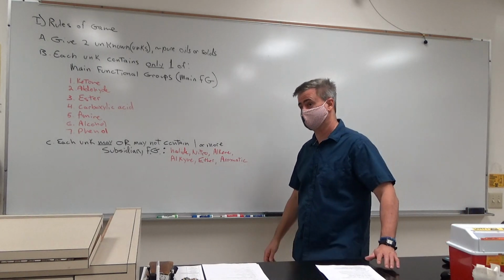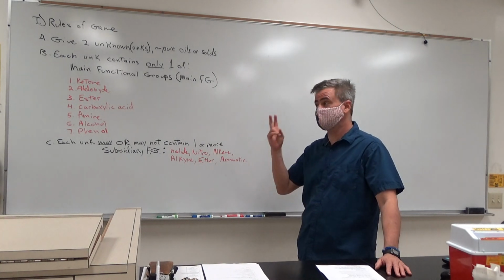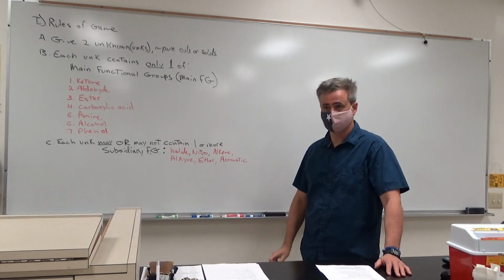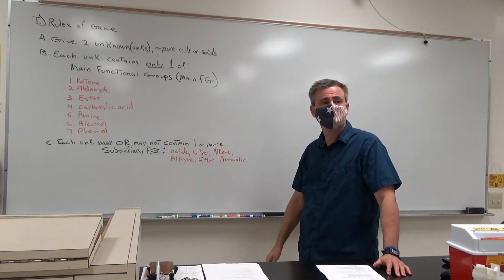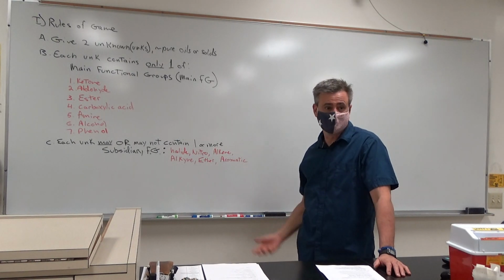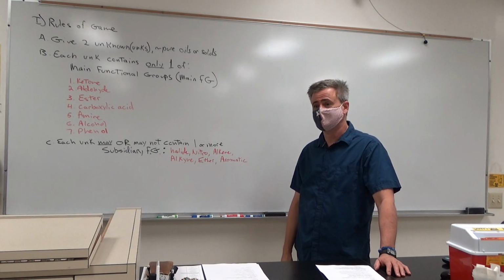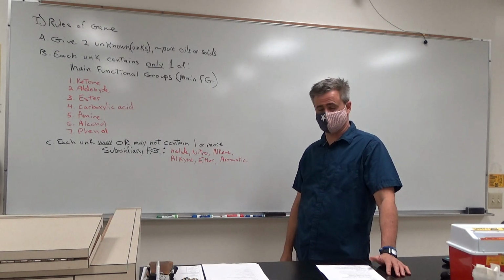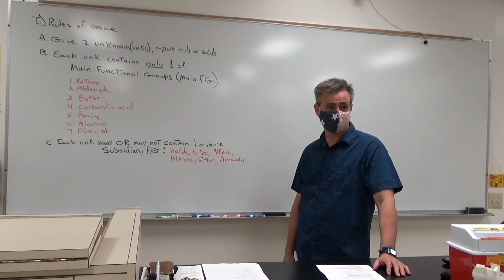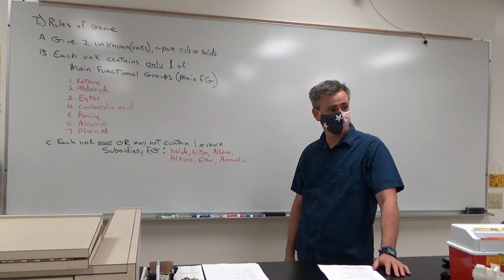Over the next 4 weeks, how many of the unknowns are we each going to do? You each get 2 unknowns, and you use the same unknown every week. They're numbered, so you'll use your number. Are we going to take the melting point of our unknown? Yes. You have to take the melting point of your unknown.